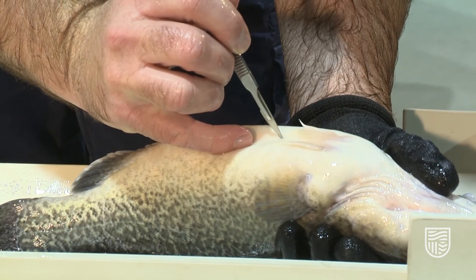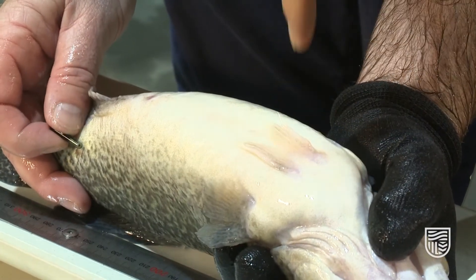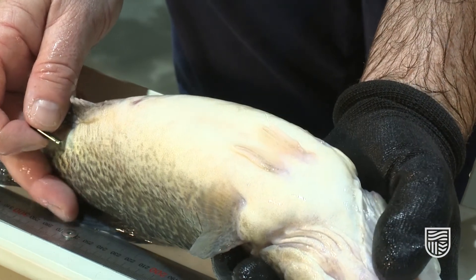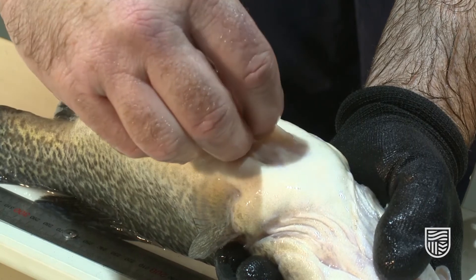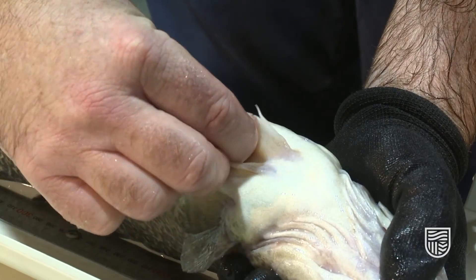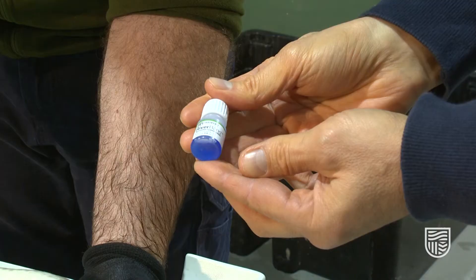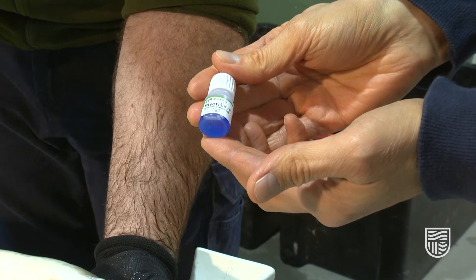The important thing here is to note that the tag runs along the fish's body, not up and down — it must run from tail to head. As Jared inserts the tag, we'll see that it's running the correct way, through the incision into the body cavity. You can see it's a very clean wound.